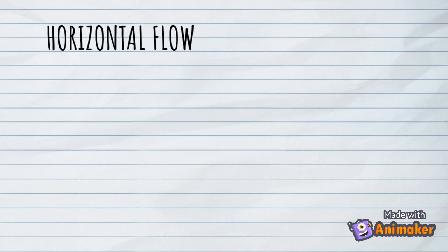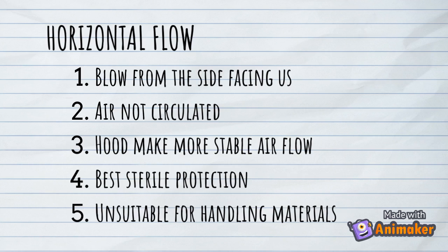For horizontal flow, airflow comes from the side, facing the operator. The air is not recirculated. Horizontal flow hoods give the most stable airflow. It has the best sterile protection, but will blow aerosols into your face and is unsuitable for handling material which is potentially biohazardous or toxic.